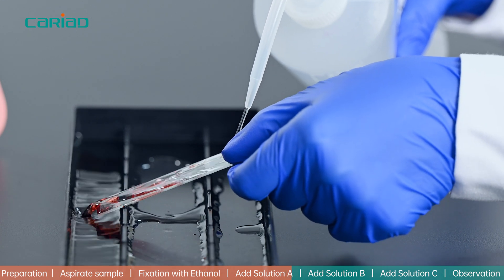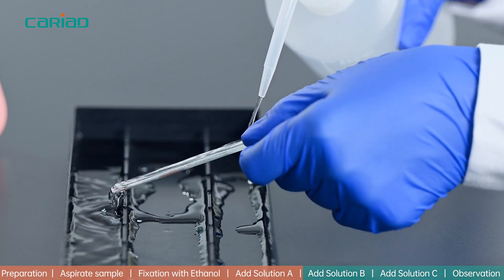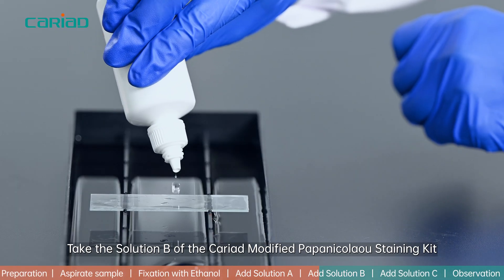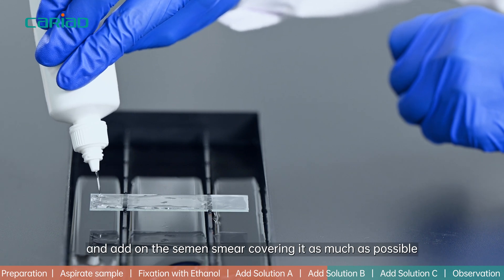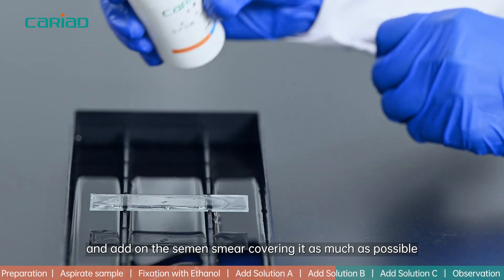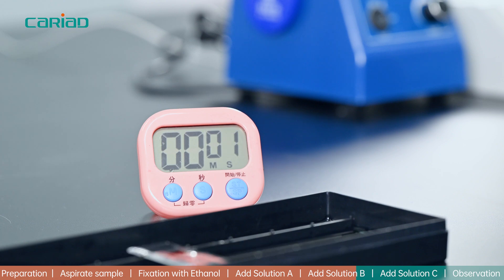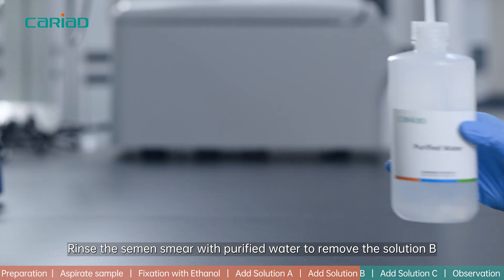Step 4: Take Solution B of the Cariad modified Papanicolaou staining kit and add it on the semen smear, covering it as much as possible. Wait for 3 minutes to let the differentiation happen, then rinse the semen smear with purified water to remove Solution B.